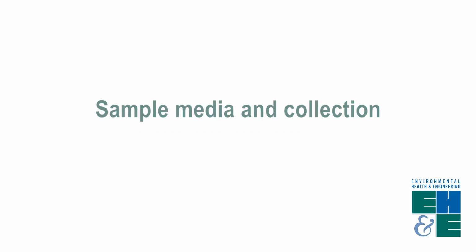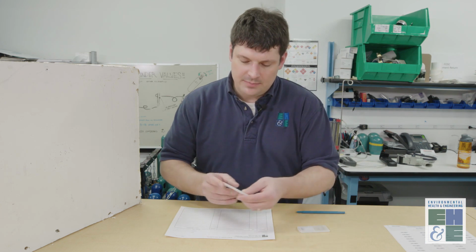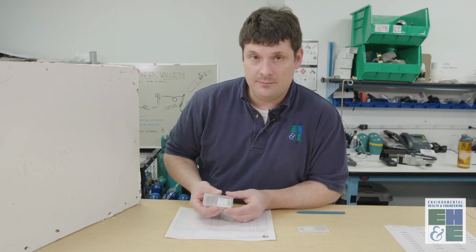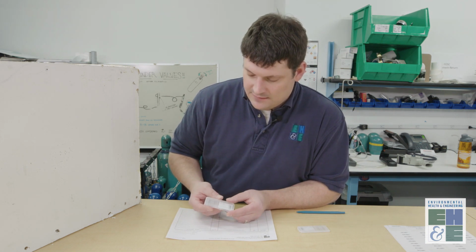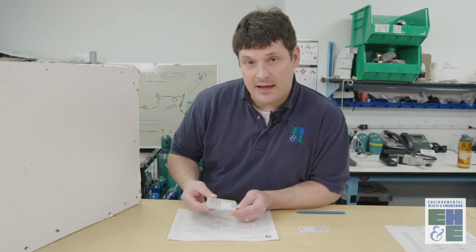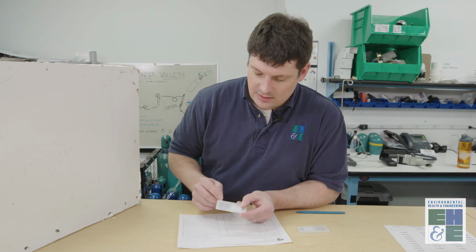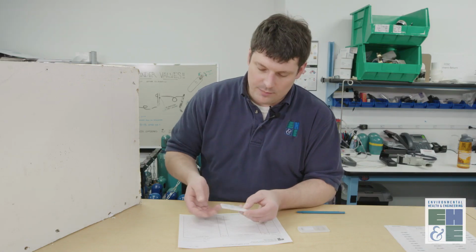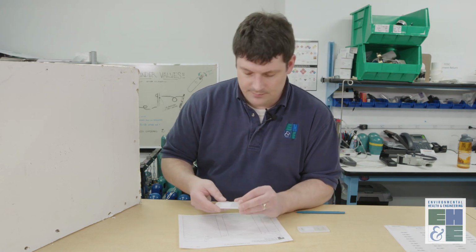Today we're going to be talking about collecting surface tape samples. We do that with biotape, which is provided by the laboratory and available in the FOSC. Each one has an individual microscope case. What's important is the case has a top indication here, so when you open it, you should open it with that on top.